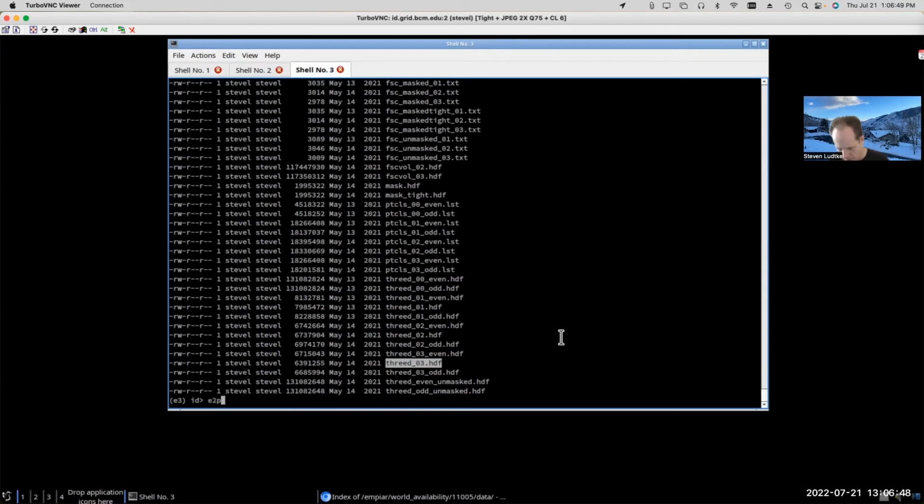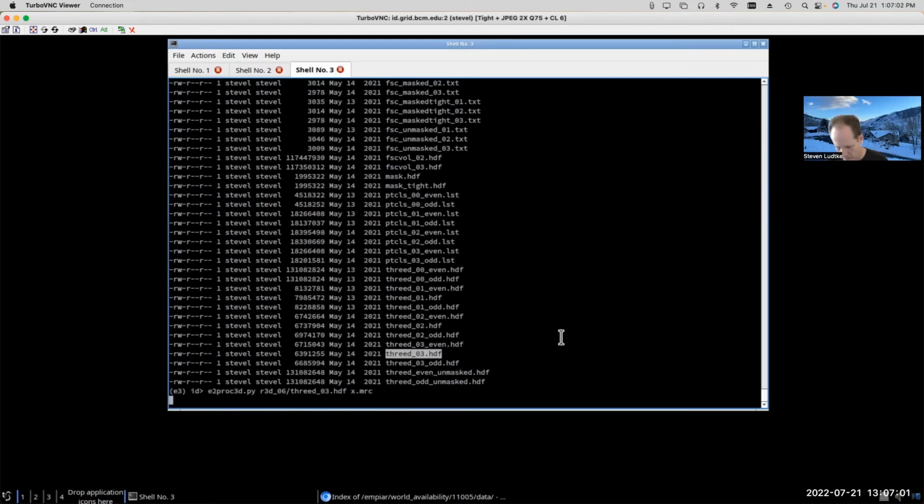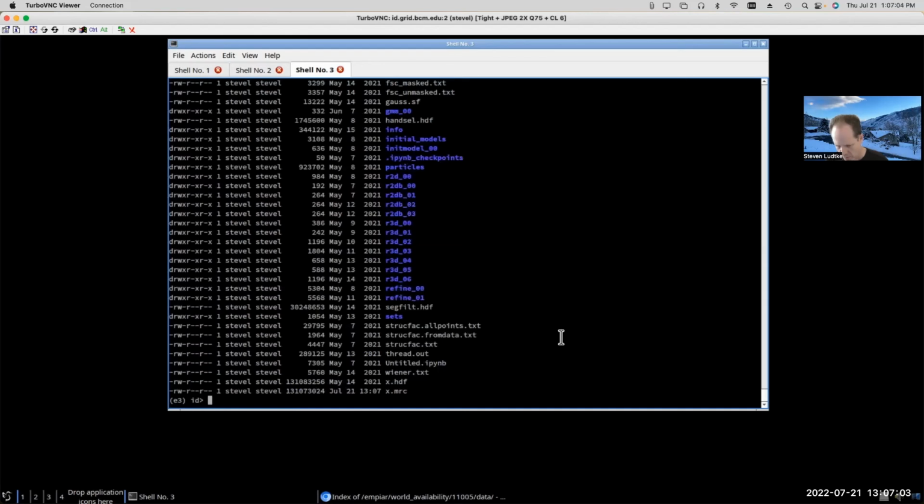If we convert that to an MRC format, so what you would see if you got it out of Relion, you can see that it was 131 megabytes.